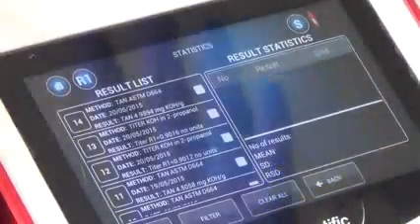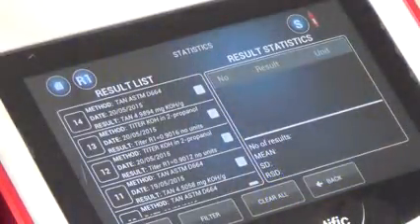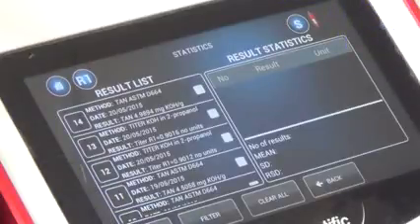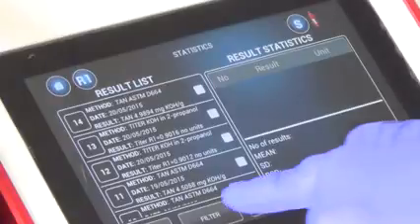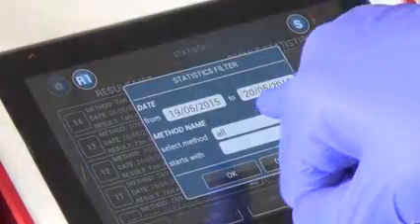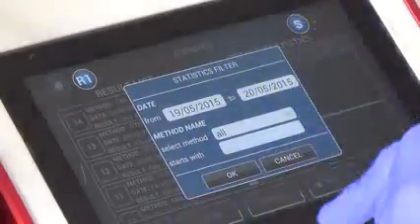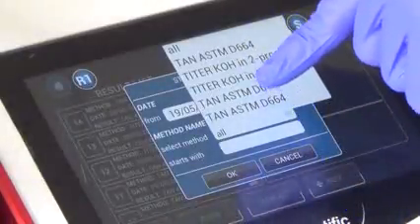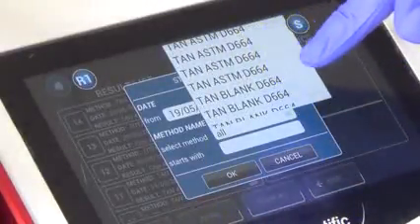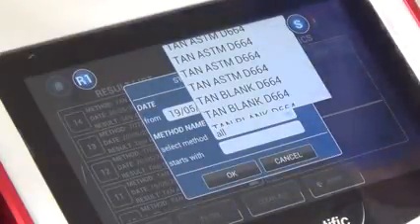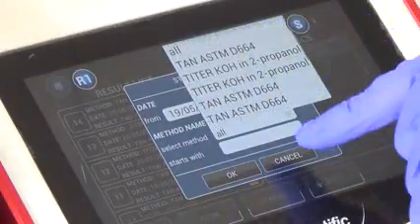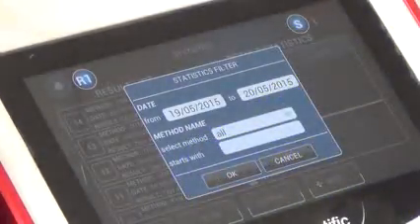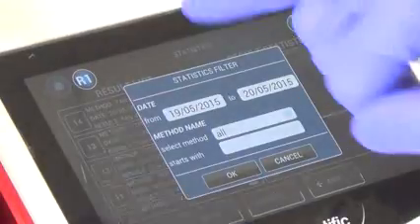The other option is, if you have a lot of results and you want to find the results quickly, it could have been a week or a month ago. Press filter. You have the options to filter from specific dates. And you can also filter methods, if you know your method name. It lists all these methods. For example, you might want to look at a TAN blank from in between a particular month. It could be November. And you can also filter if you know what the method starts with.